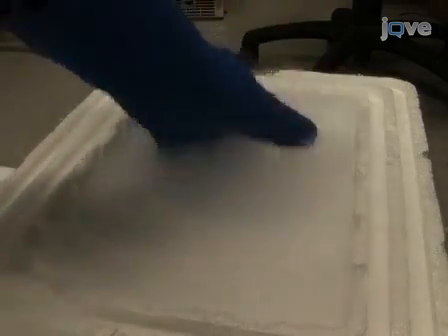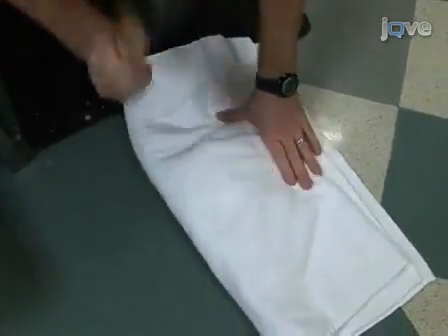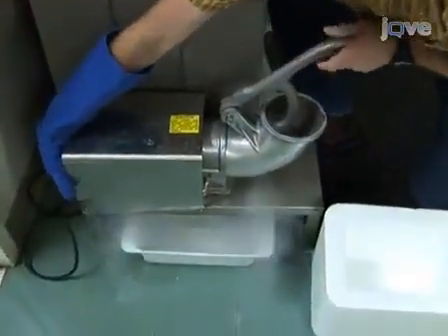It is best to freeze the sperm on finely crushed dry ice, as opposed to dry ice pellets. One simple way to crush dry ice is to wrap it in a towel and pulverize it with a hammer. A more efficient method is to use a dry ice grinder, such as a Klassen model RE2.